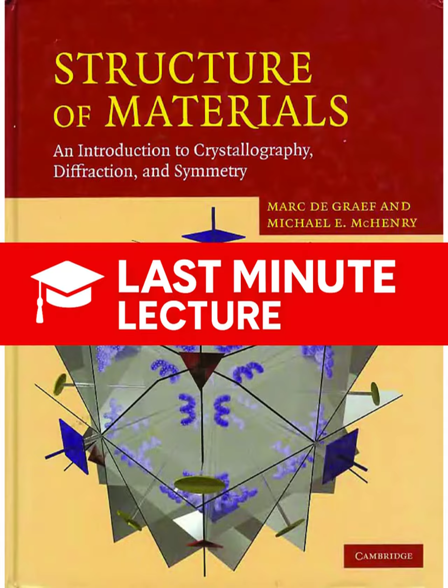And the X-ray tube is basically a very controlled particle accelerator. It starts at the cathode, typically a heated filament. And the heat causes electrons to just boil off. It does. It's a process called thermal emission. Then we apply a huge potential difference, a high voltage V, between that cathode and a heavy metal target, which we call the anode. And that high voltage zaps the electrons across the gap.